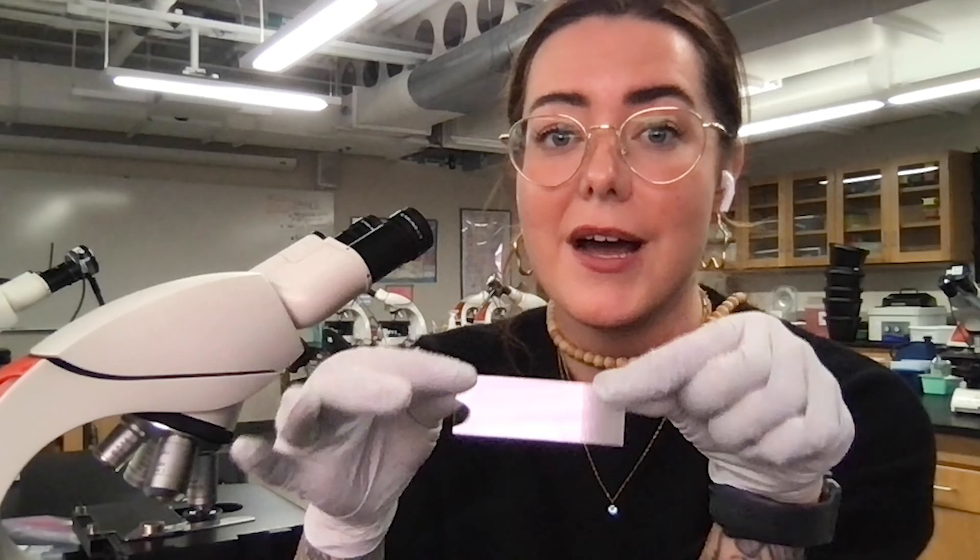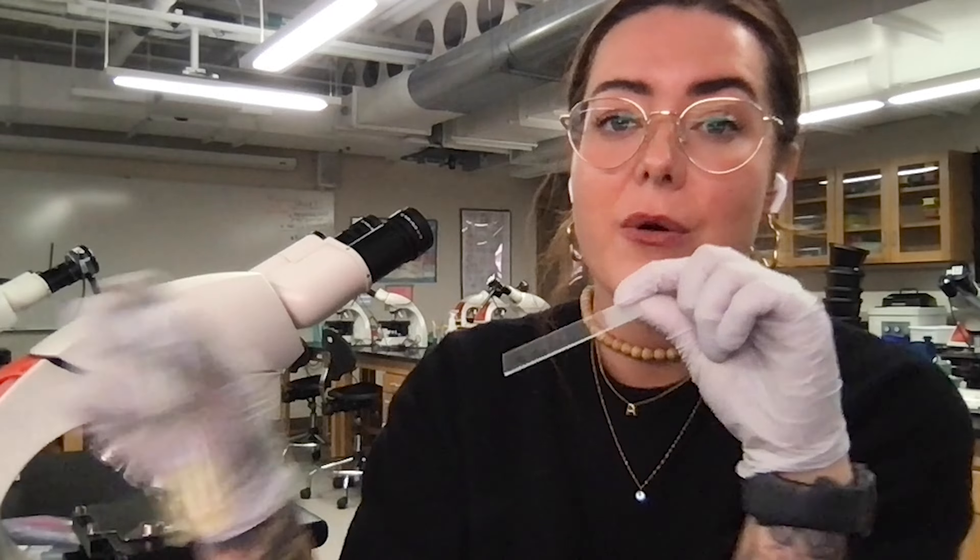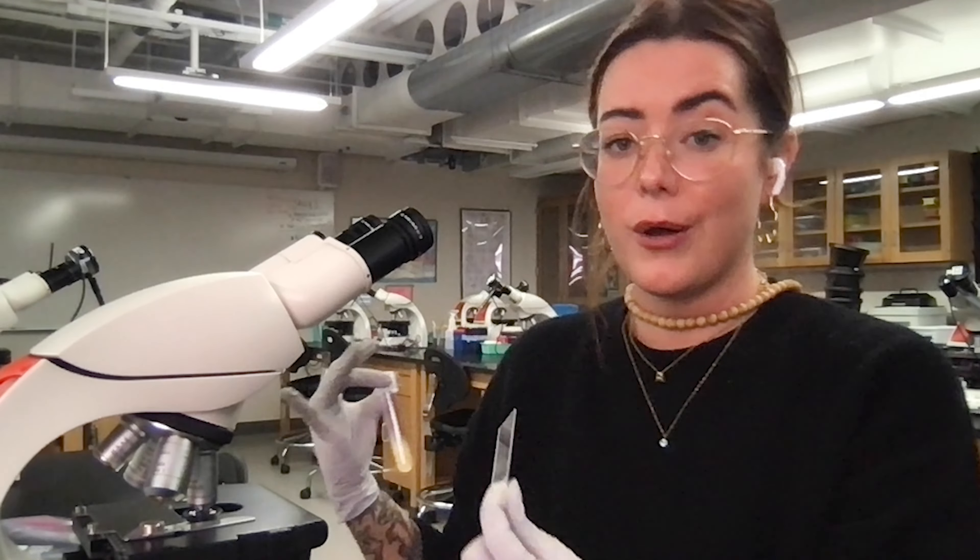Hey there, lab. In this demo, I'm going to show you how to make a wet mount slide with a drop of our cell culture specimen here so that we can get close and personal with it underneath the microscope.